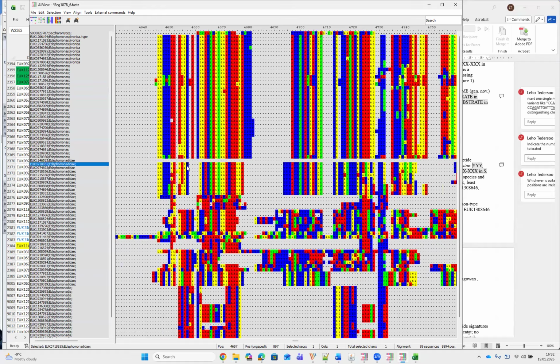So here, if we try to realign some part to find differences, we indeed see 1, 2, principally a third one, with the exception of one nucleotide here.